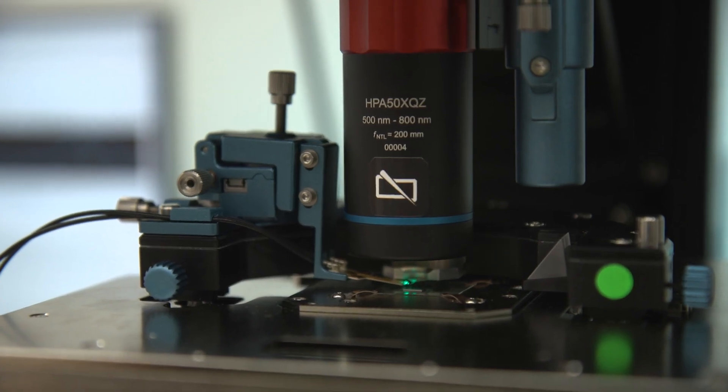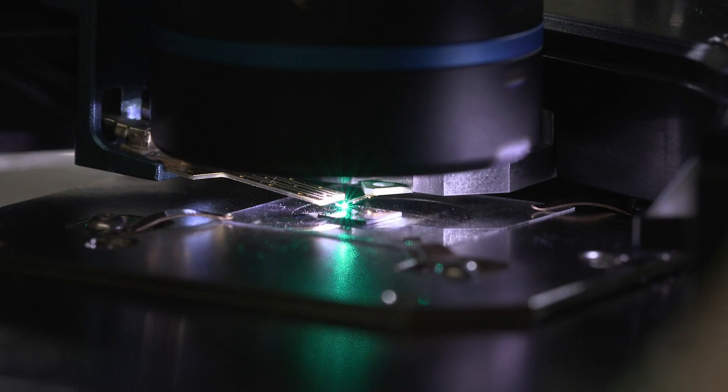So first, we actually need to find the NV center with a confocal scan. And when doing that, you see a bright light in the middle of the pillar. There is your NV.